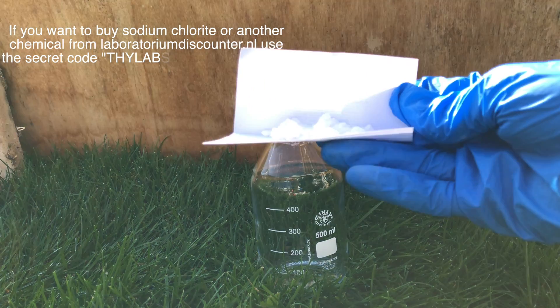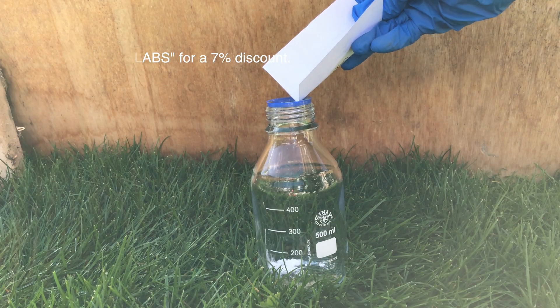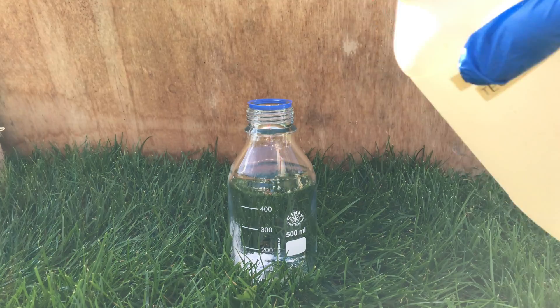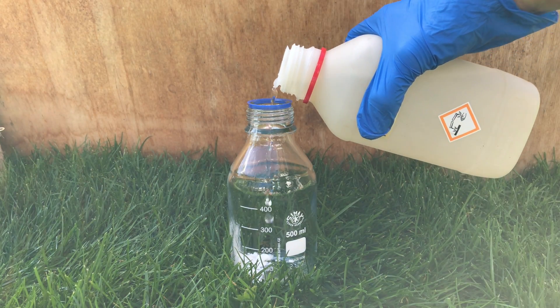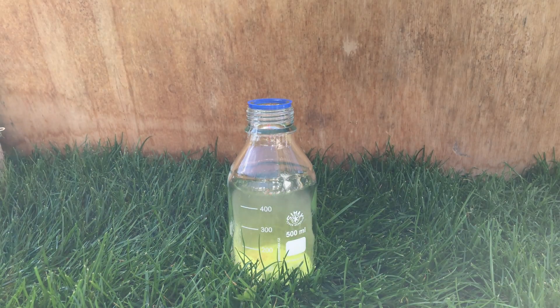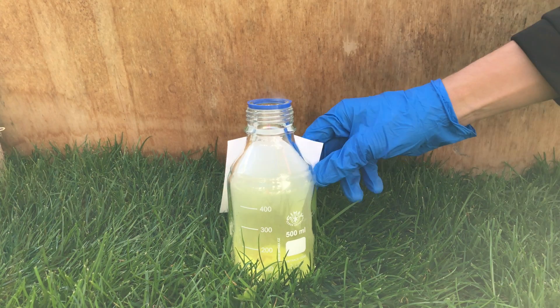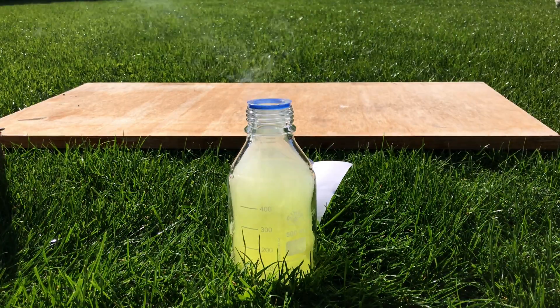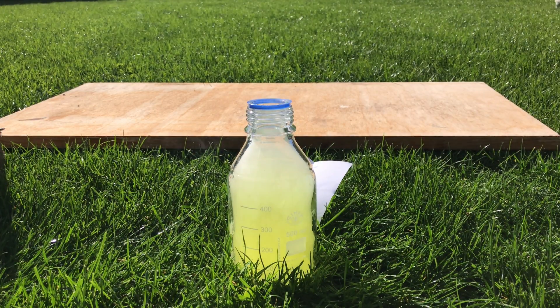To make this yellow gas you first need to add some sodium chlorite with a 't' to a bottle. Sodium chloride with a 'd' won't work because it is plain table salt. To get chlorine dioxide we then added some hydrochloric acid. When holding a piece of paper behind the bottle you can see the pungent yellow color even better. When exposed to sunlight, chlorine dioxide might violently decompose to form oxygen and chlorine.